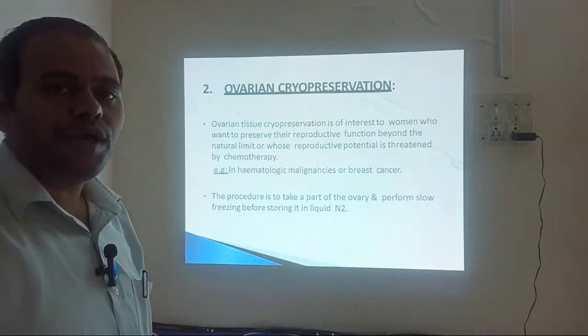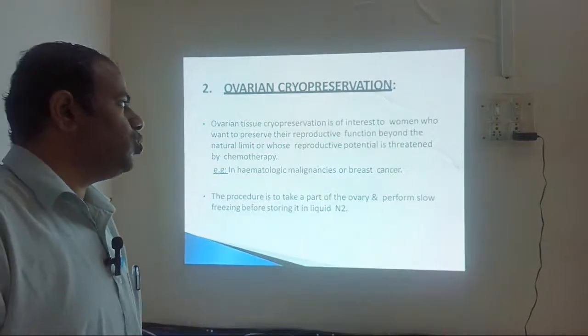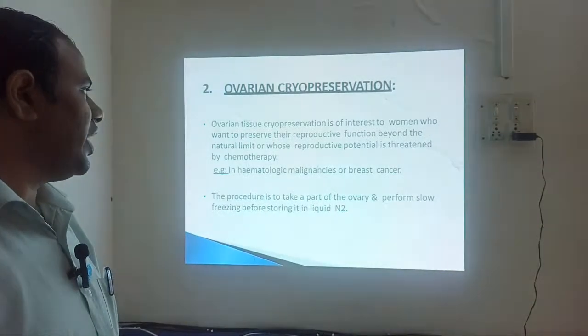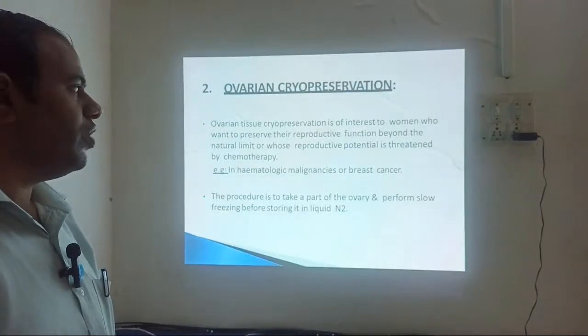Then ovarian preservation. Ovarian tissue can be preserved where certain characters are important. Tissues of the ovary can be preserved here.